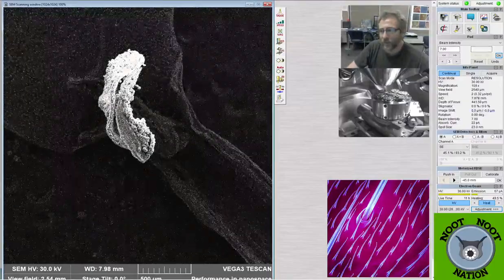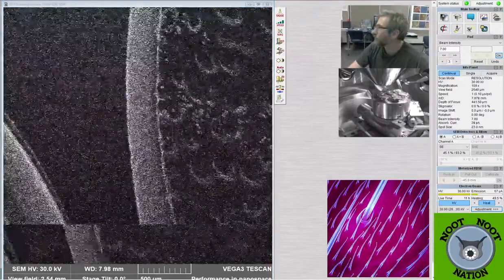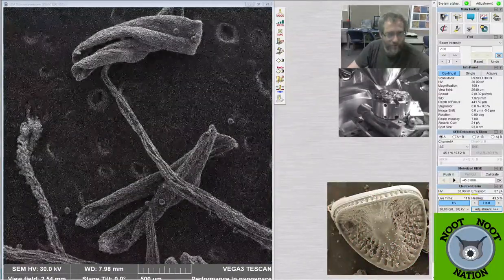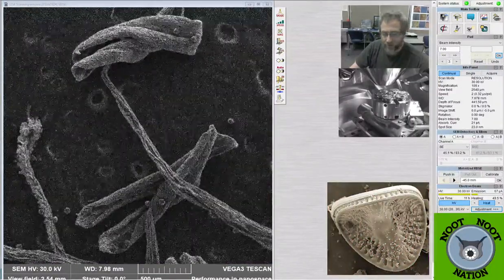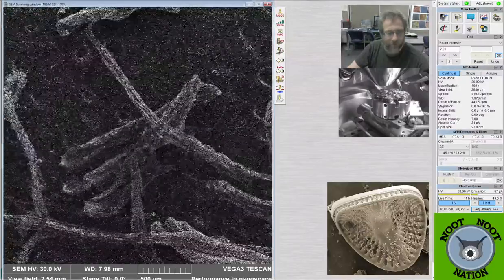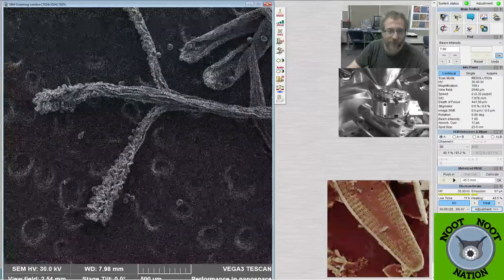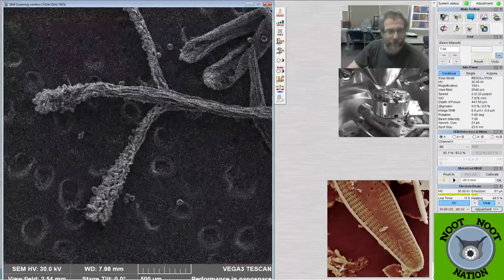Okay, so time to jump over to number 5. Let's see what's on 5: spring beauties. So these are, again, flowers I collected from my yard. The phlox I stole from campus somewhere. The spring beauties are in my yard. They're blooming right now. So this one and the violets are basically my whole yard right now, full of these things.